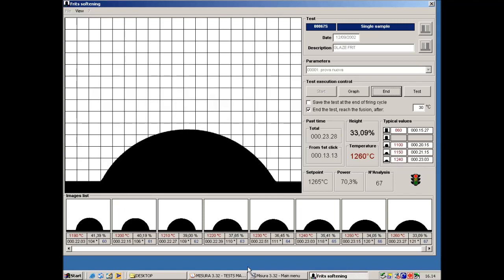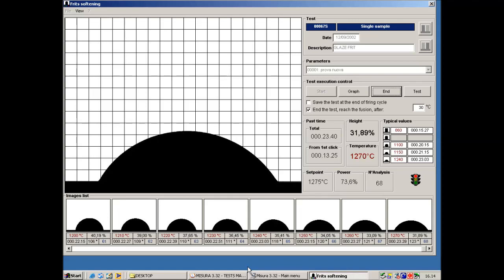The heating of the sample may go on up to the complete flattening of the sample which corresponds to the melting. The control software will automatically stop the test when the sample reaches the flattening. This function can be configured by the user and it is very useful for the test of unknown material.